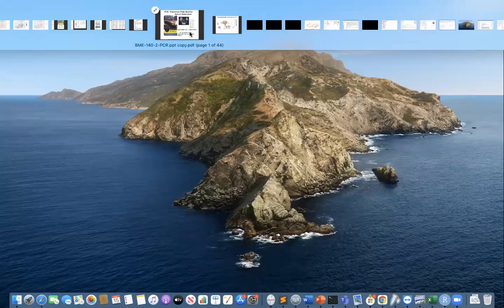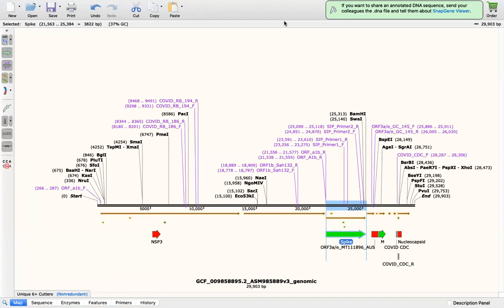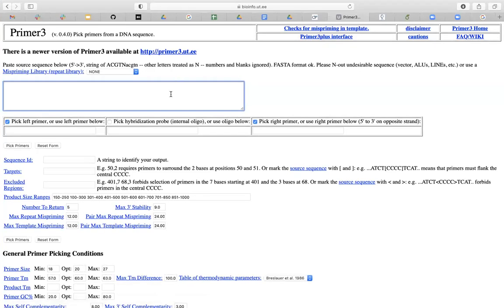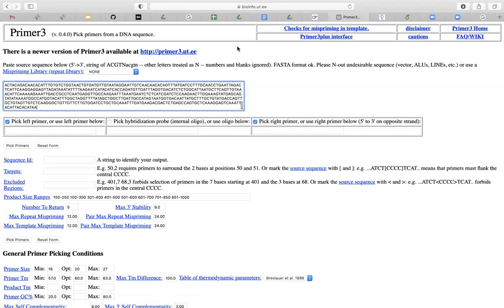And to go back to SnapGene Viewer, I just copied with Control C. Do you see that I pasted the FASTA sequence? Yes, we can see it. Can you not paste it in the chat as well? I don't know why it's not allowing me to paste.